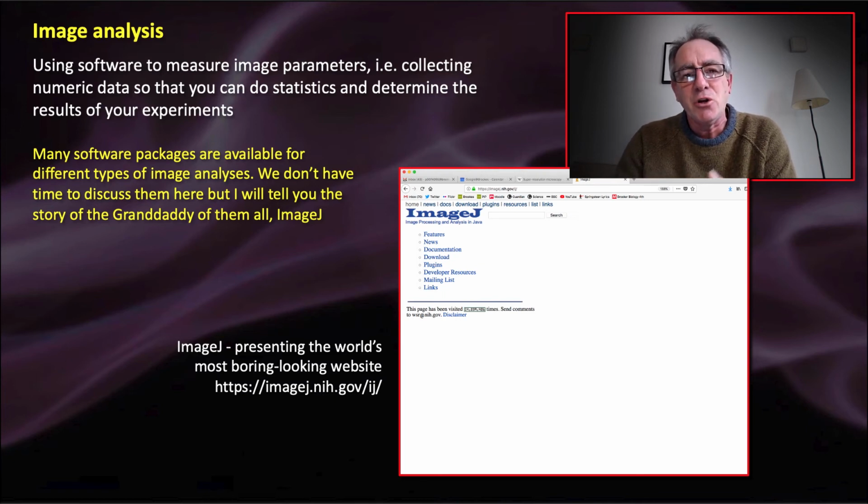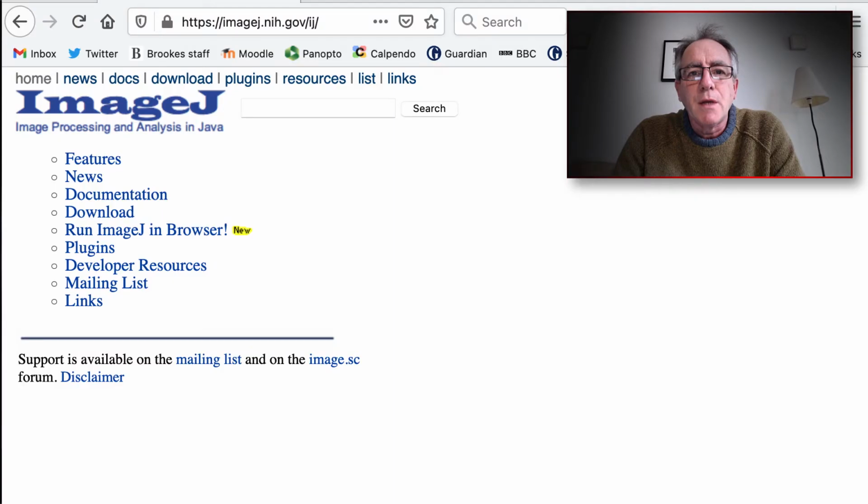And I'm now going to switch out of the PowerPoint presentation. I'm going to call this image here, and we're going to take a look at the ImageJ website. Here it is. You guys are so used to seeing super flashy websites these days. This is such an old-timey looking thing. Rasband created this in the early 1990s, when the program was still called NIH Image, by the way.